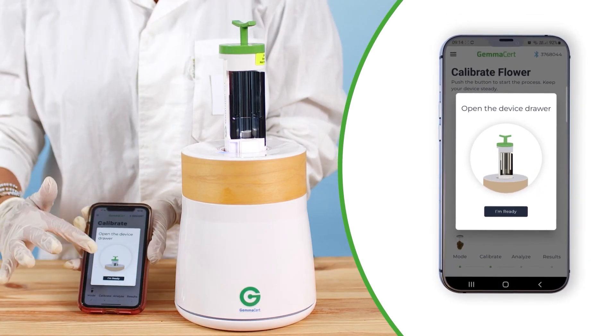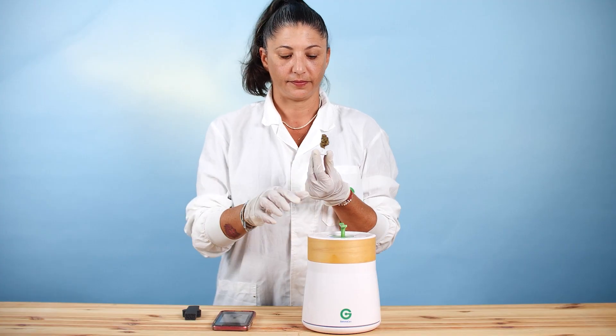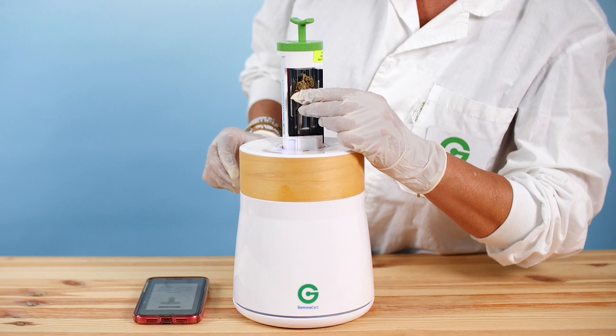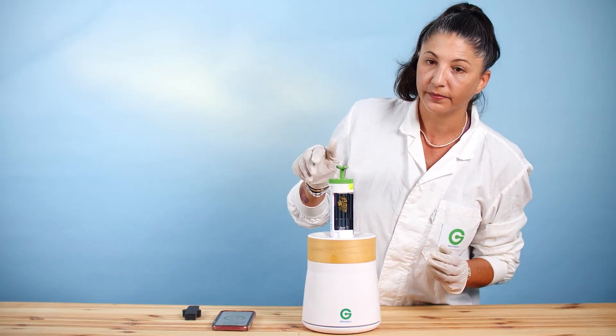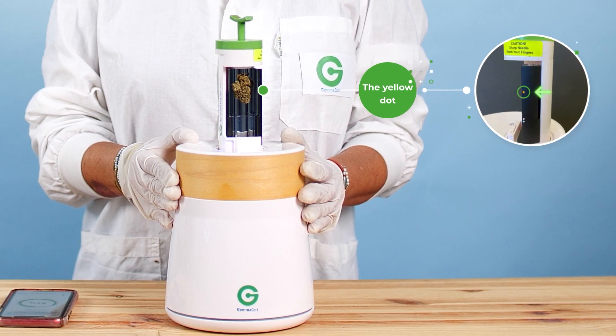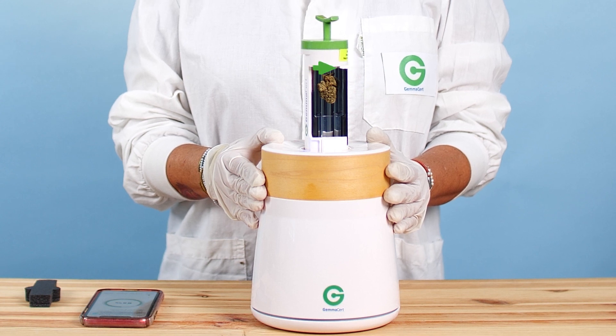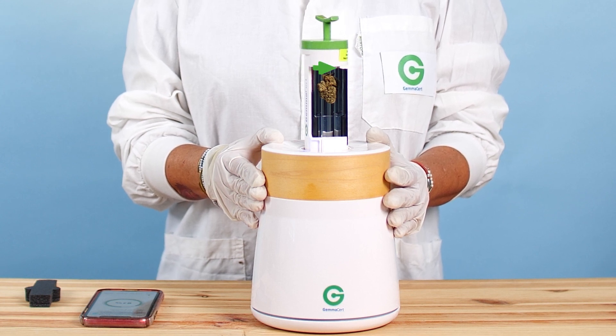Pull the drawer out and then press OK. Stick the flower pin into the flower and insert the pin into the sample holder. Adjust the flower's position by aligning the middle of the flower with the yellow dot close to the reflector top. Make sure the flower is not bulging out of the sample holder. You may rotate the flower using the green handle on top of the drawer.